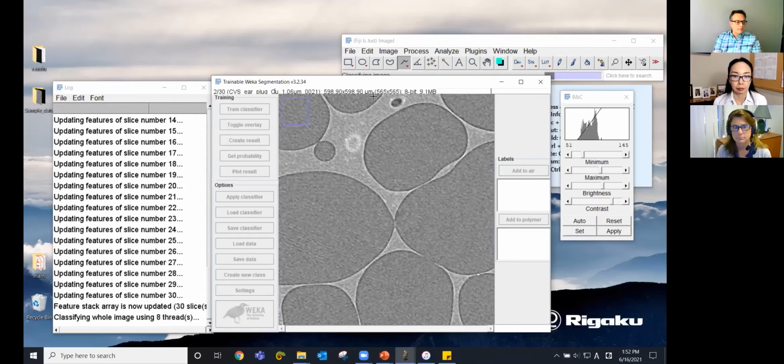Okay. All right. And then another question here, and I need to read the original. What if we need to count the high density particle instead of the air pocket? So the question is with respect to a composite with particles in the matrix. So it's kind of reassigning what the volume area is, perhaps.